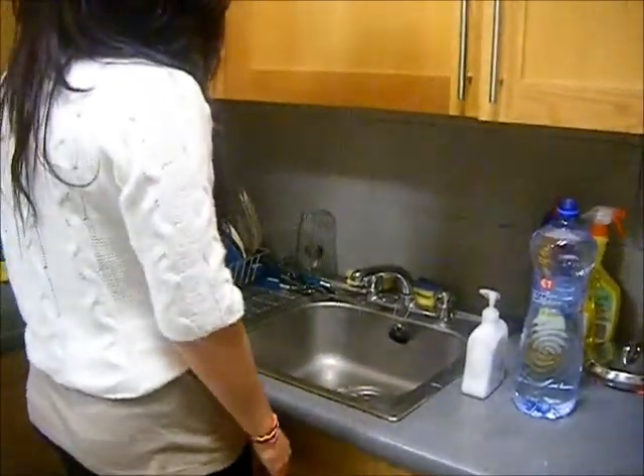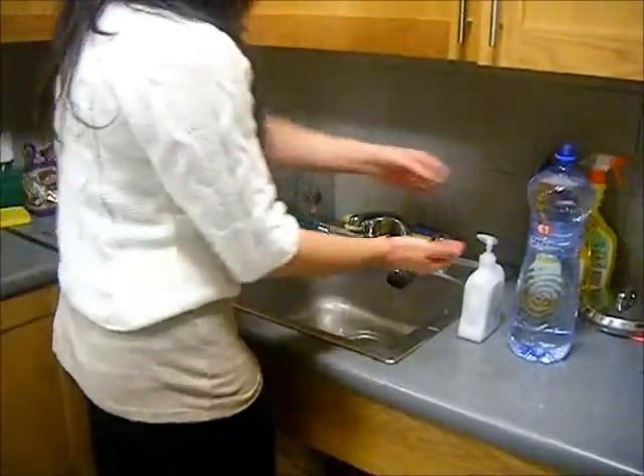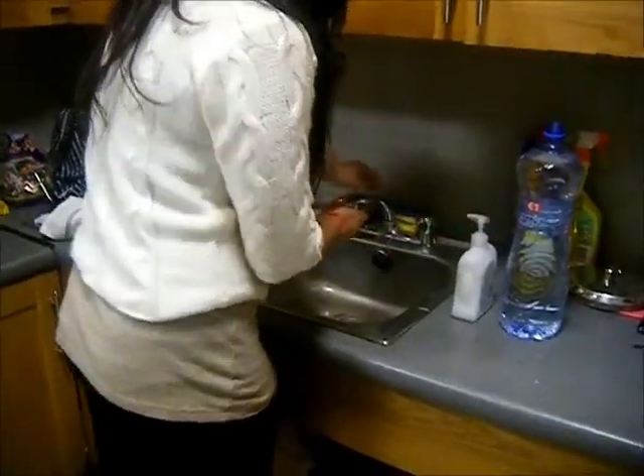This is a simple demonstration of the lather test, which is used for testing the hardness of water. First, water from the tap will be used to see how much of a lather is formed with soap.